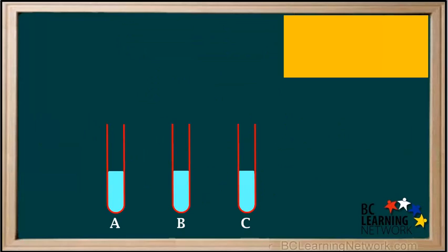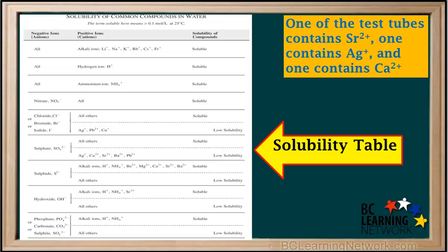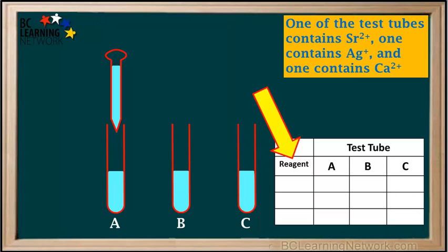Let's do a little experiment. We're given three test tubes: A, B, and C. One of the test tubes contains strontium, or Sr2+ ions. One test tube contains silver, or Ag+ ions, and the other one contains calcium, or Ca2+ ions. Our job is to find out which is which. We need to have the solubility table handy, and we'll add a little table here to record our results.